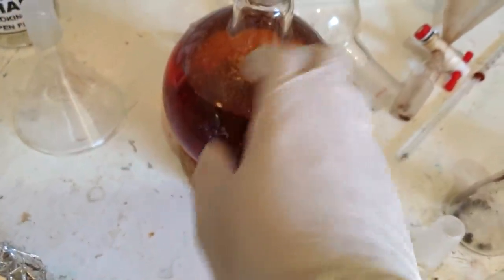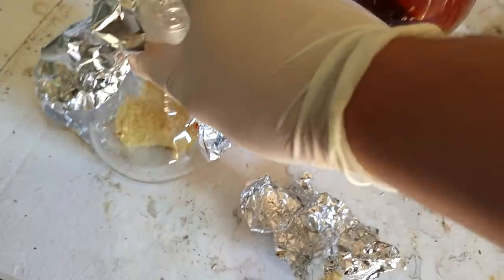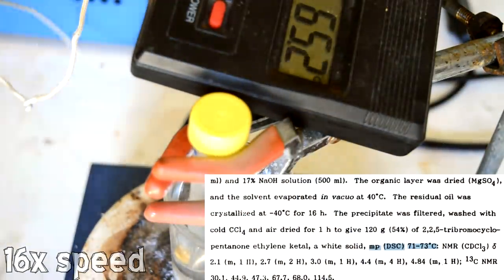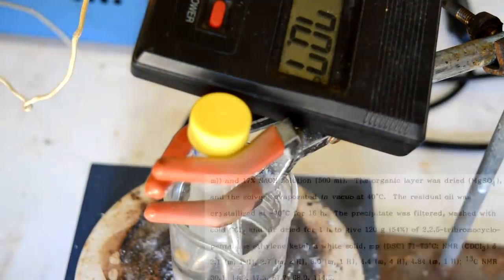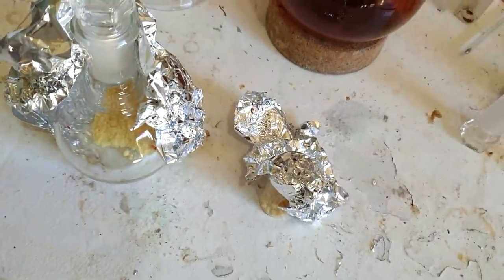So we lost a lot there. This is all our bromide washings from earlier with the sep funnel. So there's probably a lot of product in there. Should really do a melting point test before we're too confident about it. Should melt around 70 to 80 degrees. Yeah, absolutely excellent.